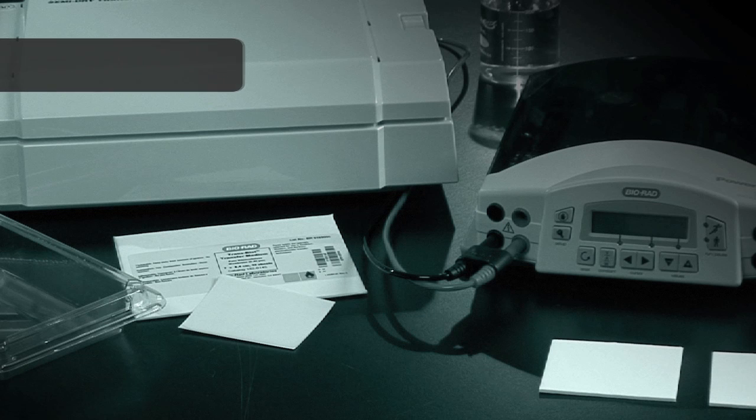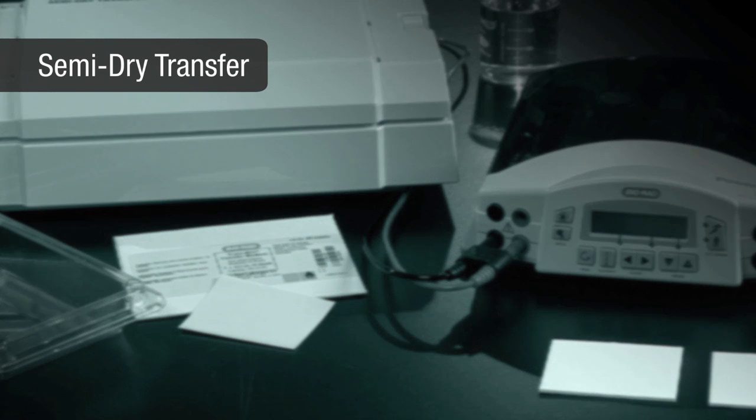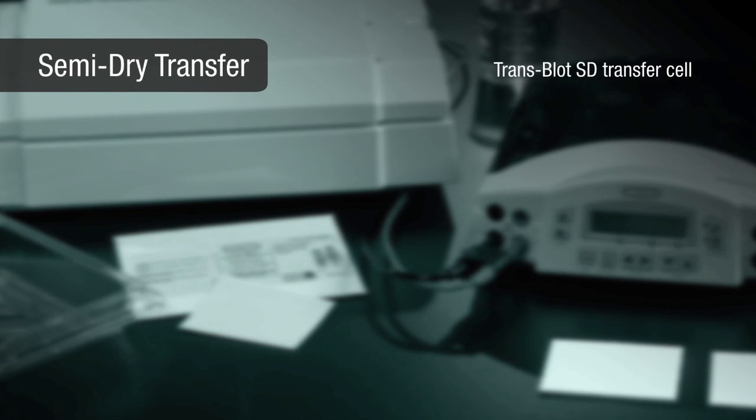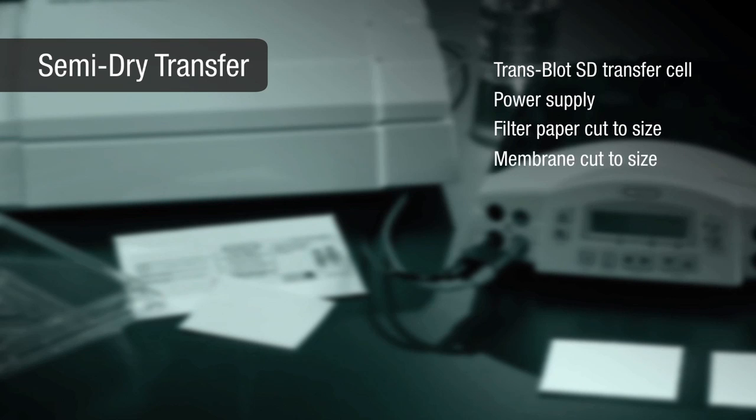The Trans-Blot Semi-dry system also requires a number of components including a Trans-Blot SD transfer cell, a power supply, two pieces of extra-thick filter paper, and a nitrocellulose or PVDF membrane cut to the size of the gel. You will also need to make 200 milliliters of buffer per gel for the transfer.